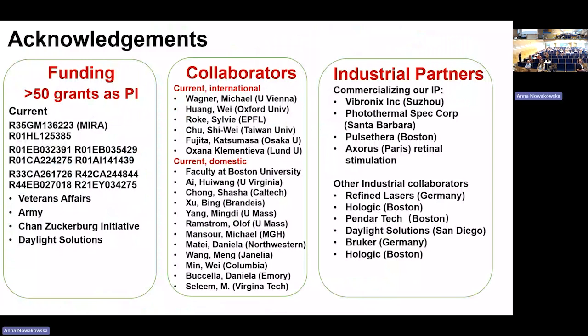Thank you so much. That was awesome. I'm Sydney Schuster from Yale University. I was curious about the polyQ data, where you see this change in protein secondary structure. So it sort of looks like you're still getting an aggregation, right? Because you have these nodes appearing, but you're not seeing beta sheet or very significant beta sheet signal. Do you think it's a helical-based aggregate there, and you think all the beta sheet signal you're seeing is coming from the beta barrel of the GFP, or what are your thoughts on that?